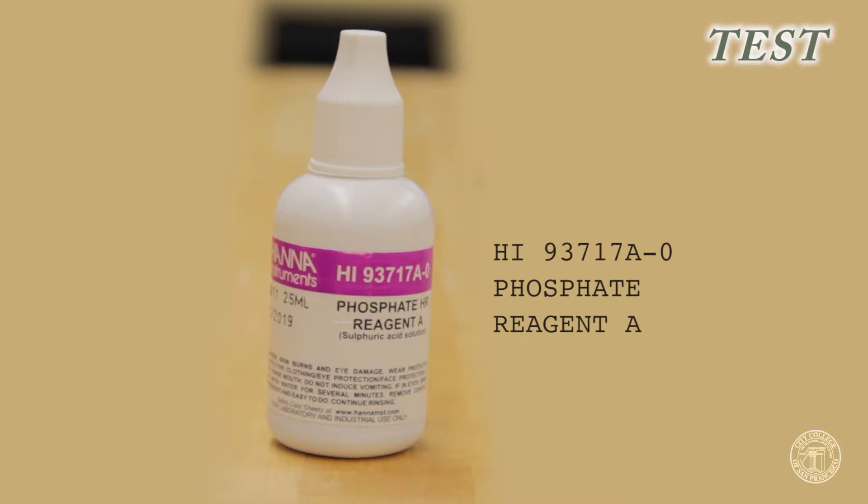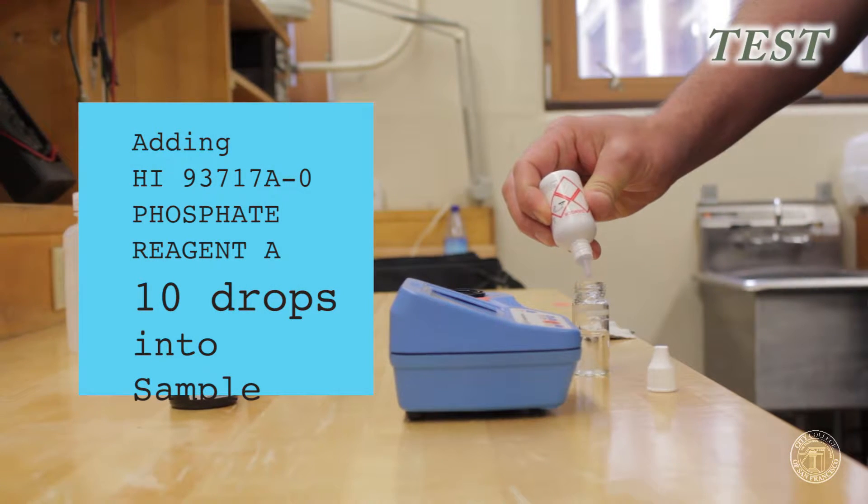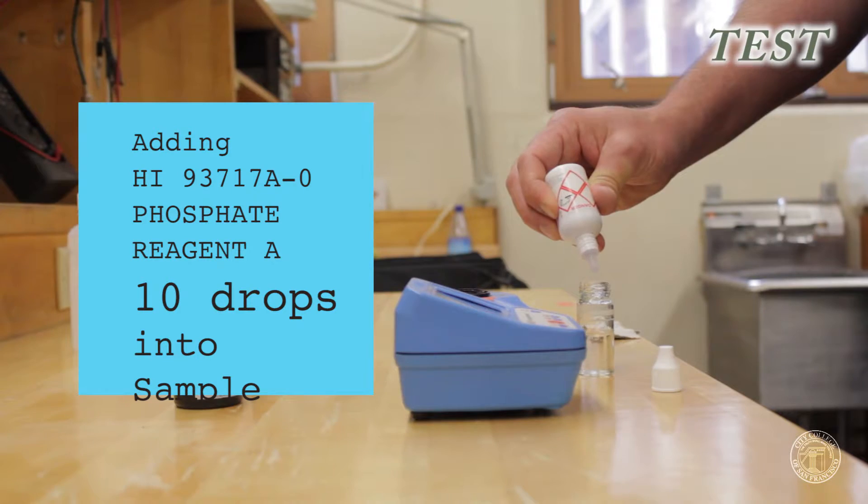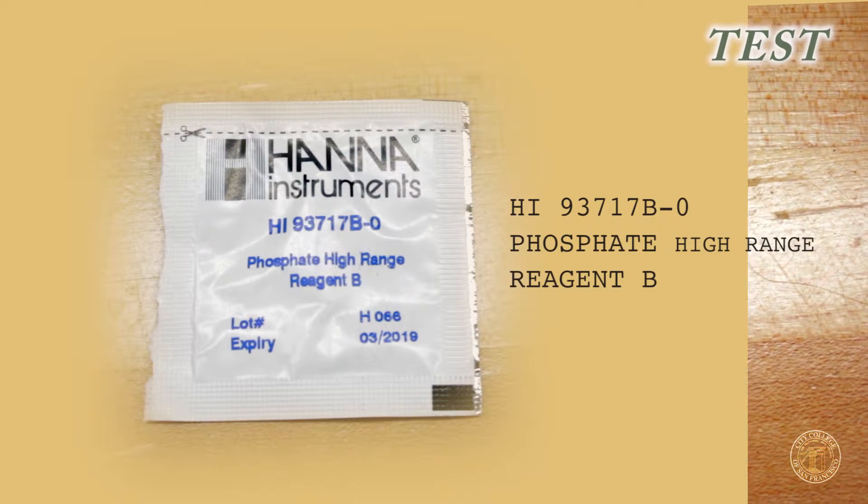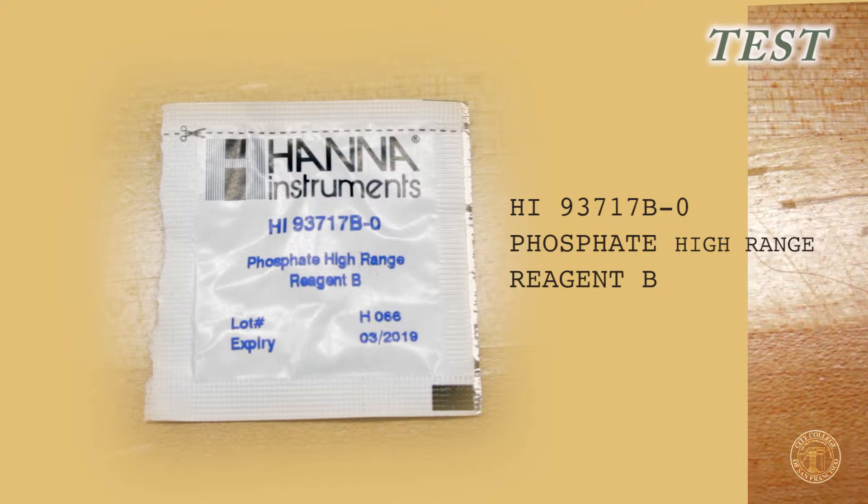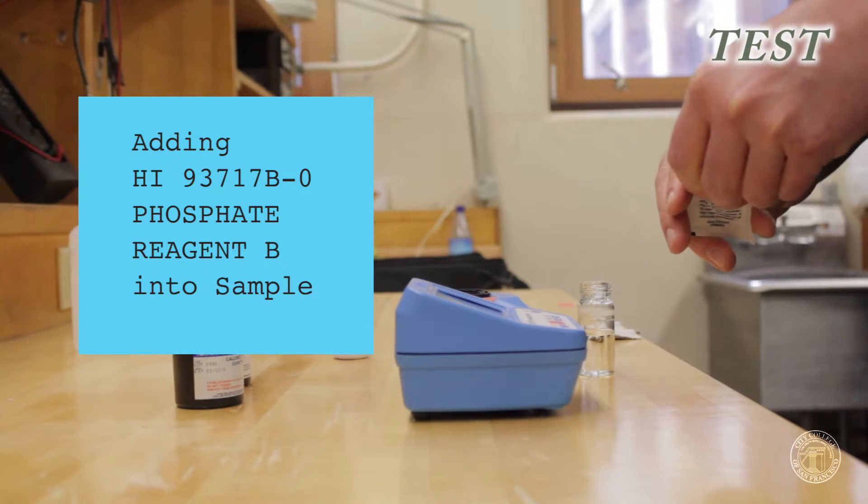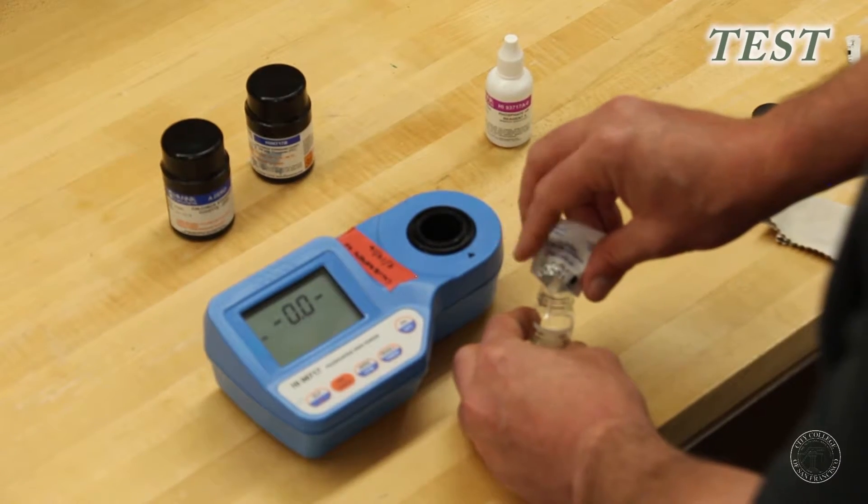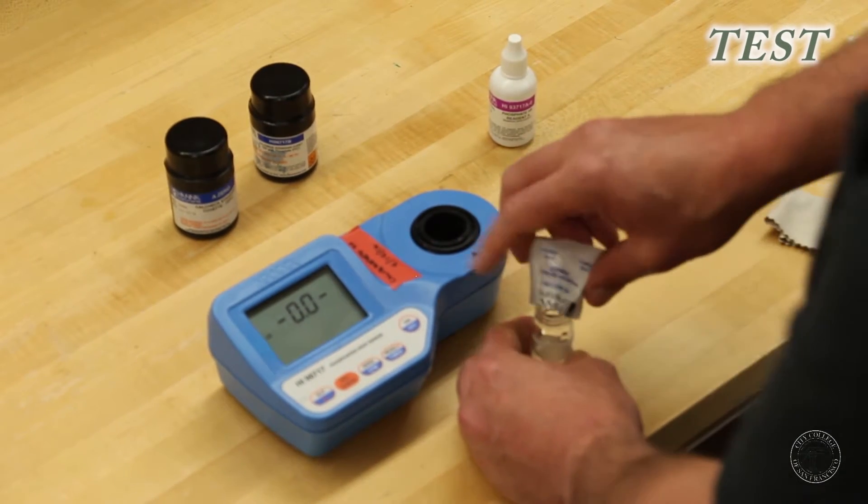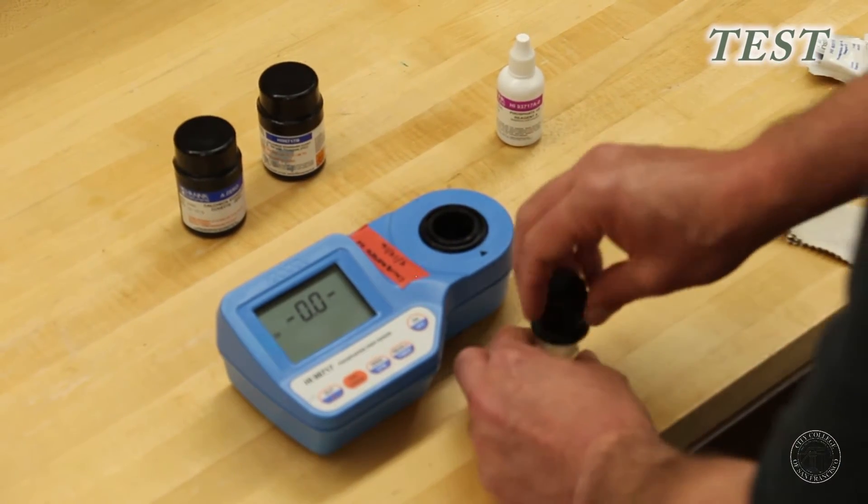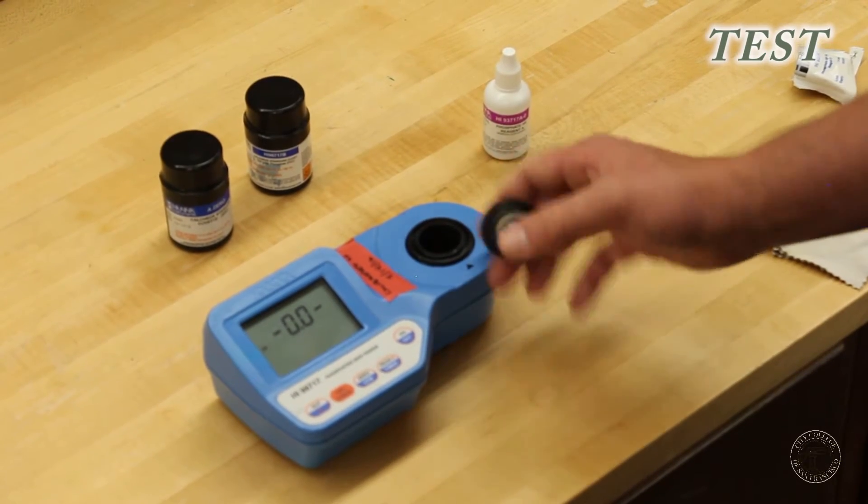You'll use reagent A. Ten drops of this go into your sample. Once you add that, you'll add your reagent B, one full pack of the phosphate high range reagent B. And now replace your cap. Invert a few times gently to mix. Try not to make any bubbles here in your solution.